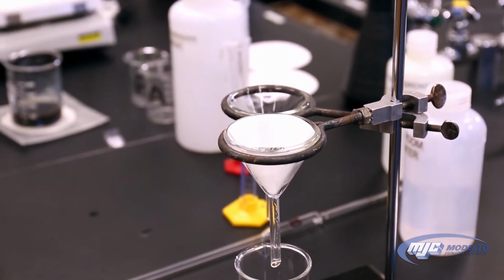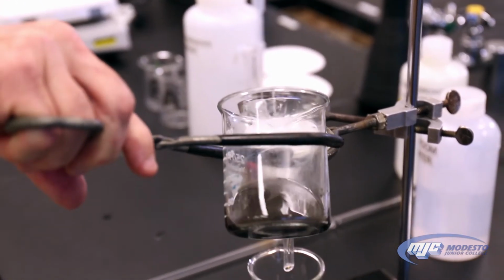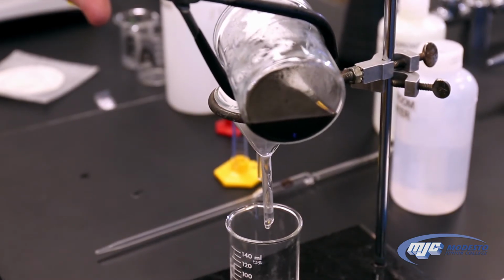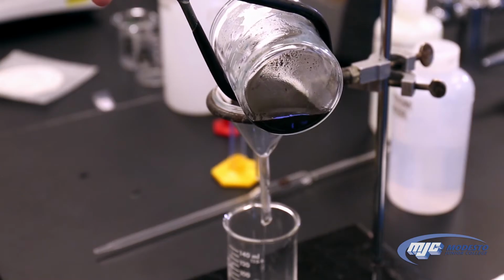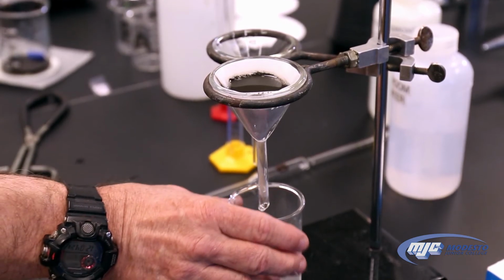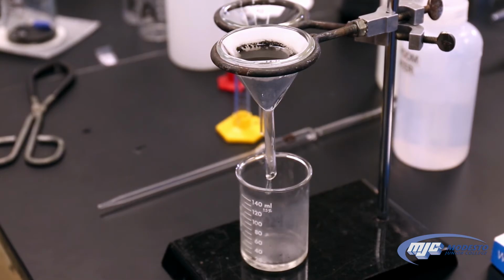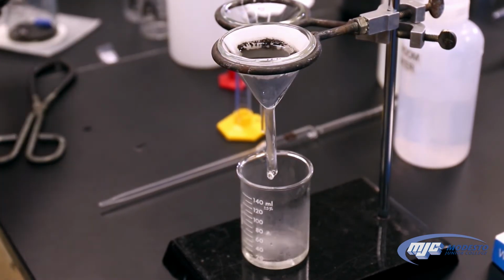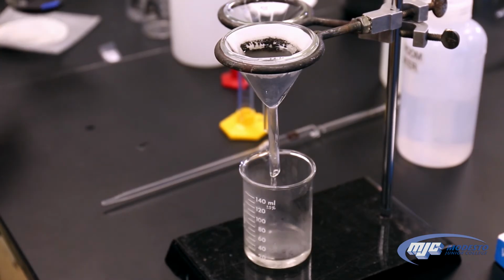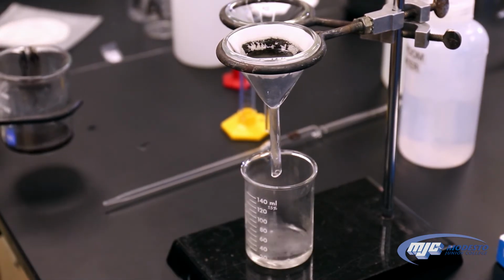So now we're going to take our copper two oxide and filter it. So we're going to pour it in here, making sure it doesn't overflow. And you won't be able to probably get it all in there in one shot. That's okay. It takes a little while. Let it filter. If you'll notice, in the bottom, it's clear. Copper two oxide's on the top. Once all the water has pretty much gone through, we can keep adding this until we've got all of our copper two oxide onto the filter paper. Some of the copper two oxide is going to be sticking to the sides, so we just use some deionized water, rinse it off, make sure we get it on there.